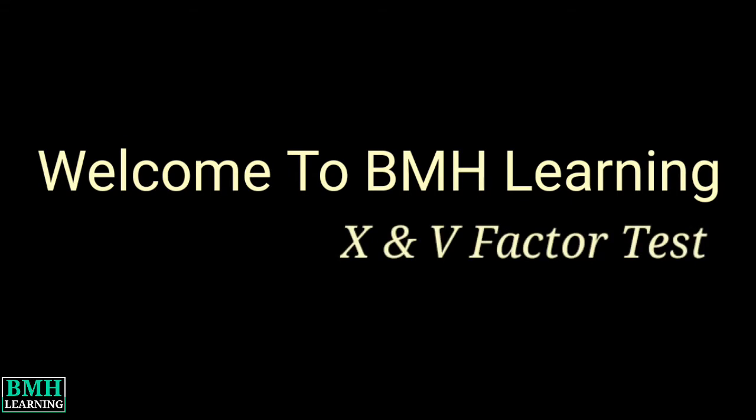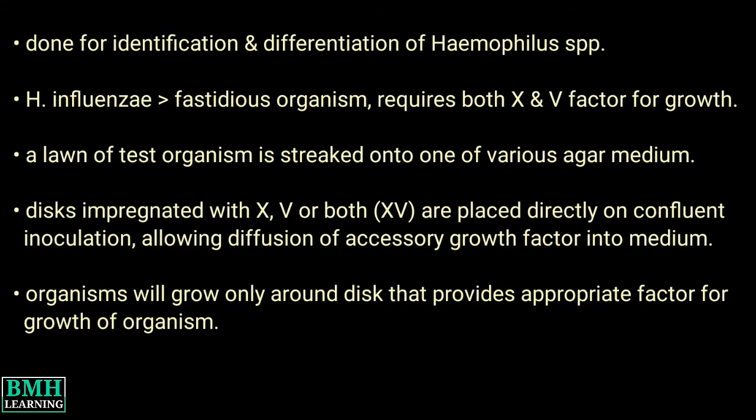This video is regarding the X and V factor test. The X factor and V factor test is done for the identification and differentiation of Haemophilus species, especially identification of Haemophilus influenzae. H. influenzae is a fastidious organism that requires both X factor and V factor for growth.